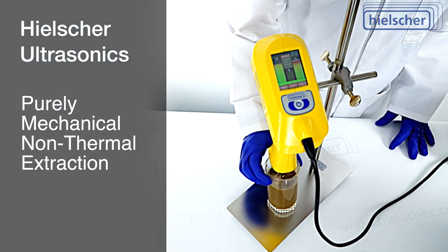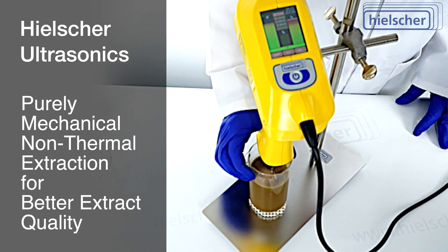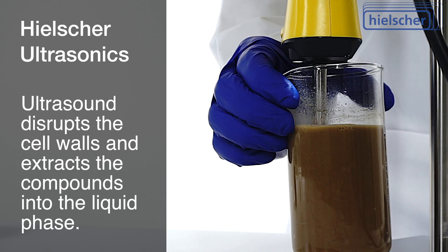Ultrasonic extraction is a purely mechanical, non-thermal extraction technique that preserves thermally labile molecules. Ultrasound disrupts the cell walls of plants and fungi and extracts the bioactive compounds into the surrounding liquid.